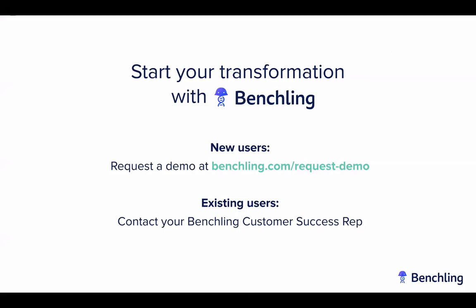Many folks will leverage our concatenation method to design their vectors using some of the other cloning methods that we didn't explicitly describe, for example restriction enzymes and Gibson, and then create specific primers to make those fragments on the bench. That's certainly something our clients do often. If you're working with a customer success representative, they can help you design and optimize that workflow. Great.